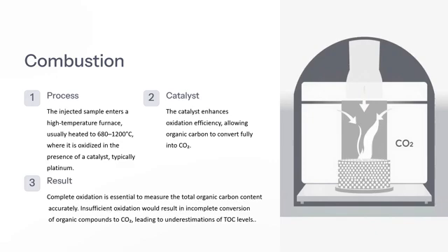So the process is that all organic carbon in the sample is oxidized to CO2. The catalyst enhances the efficiency of oxidation, ensuring complete conversion of organic matter to CO2. So this step is crucial for accurate quantification, as incomplete oxidation can lead to underestimation of the TOC levels.